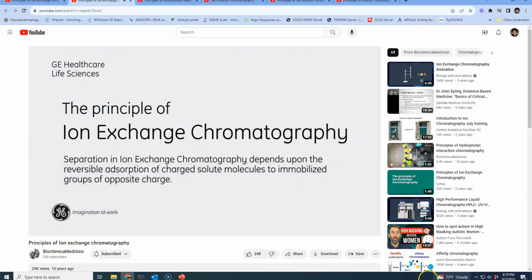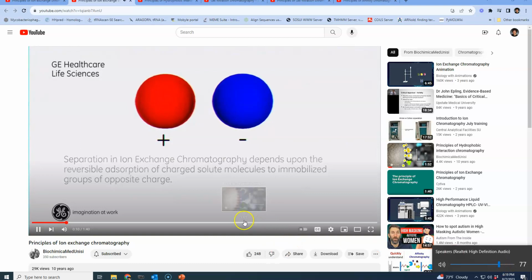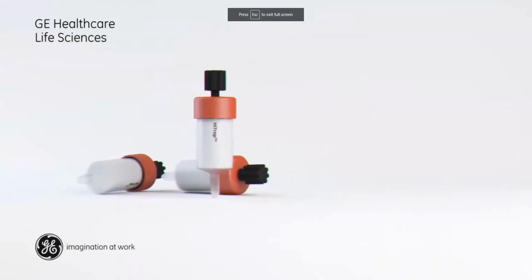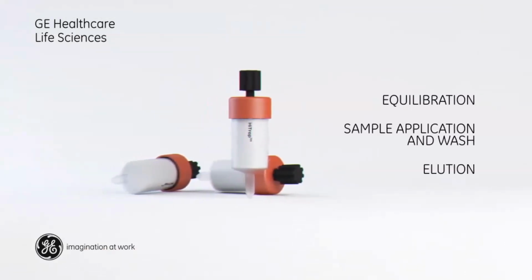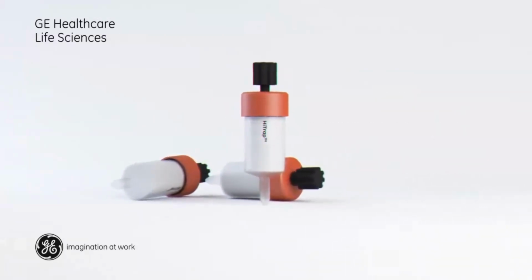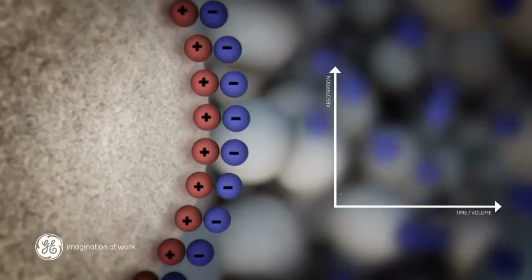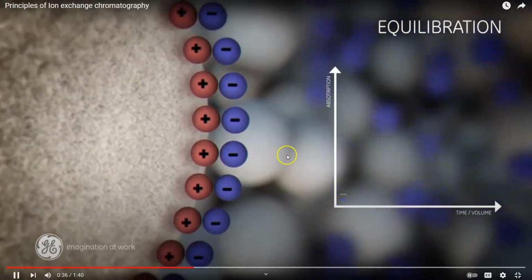Ion exchange chromatography depends upon the reversible adsorption of charged solute molecules to immobilized groups of opposite charge. Most ion exchange experiments are performed in 4 main stages: equilibration, sample application and wash, elution, and regeneration. The first step is the equilibration of the stationary phase to the desired start conditions. When equilibrium is reached, all stationary phase charged groups are associated with exchangeable counterions such as chloride or sodium.